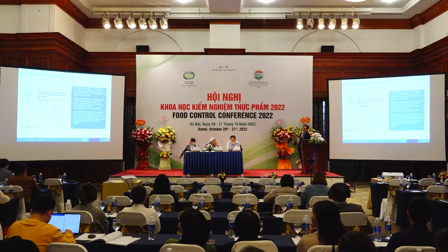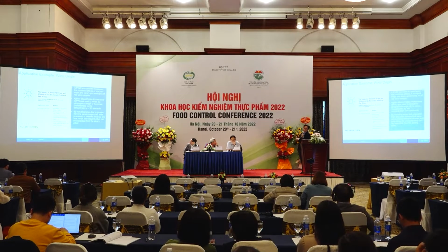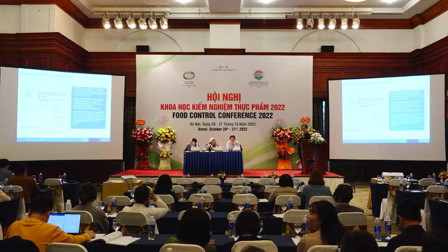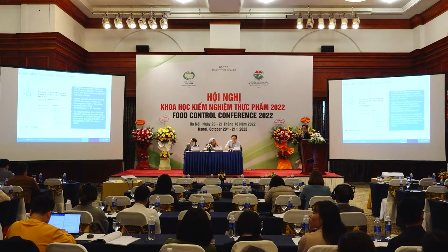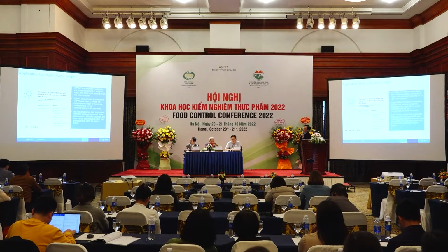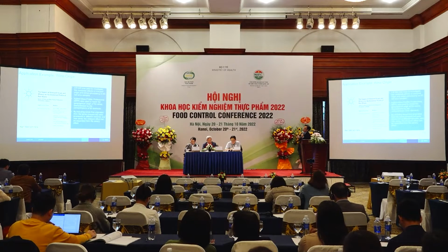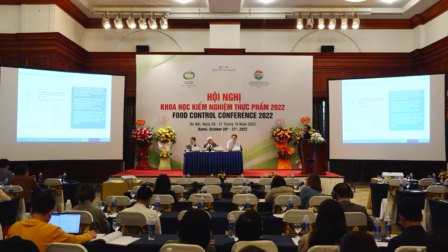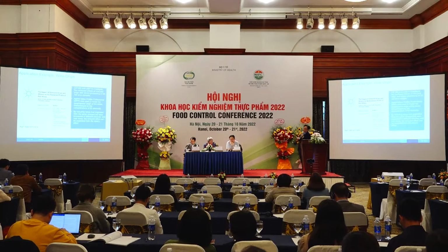Let's look at this example. It looks at the impact of both the vineyard as well as the winery, using elemental profiling to see if we can determine where the wine comes from. In this application, we are looking at about 65 wine samples from, I think, 5 different vineyards in California.